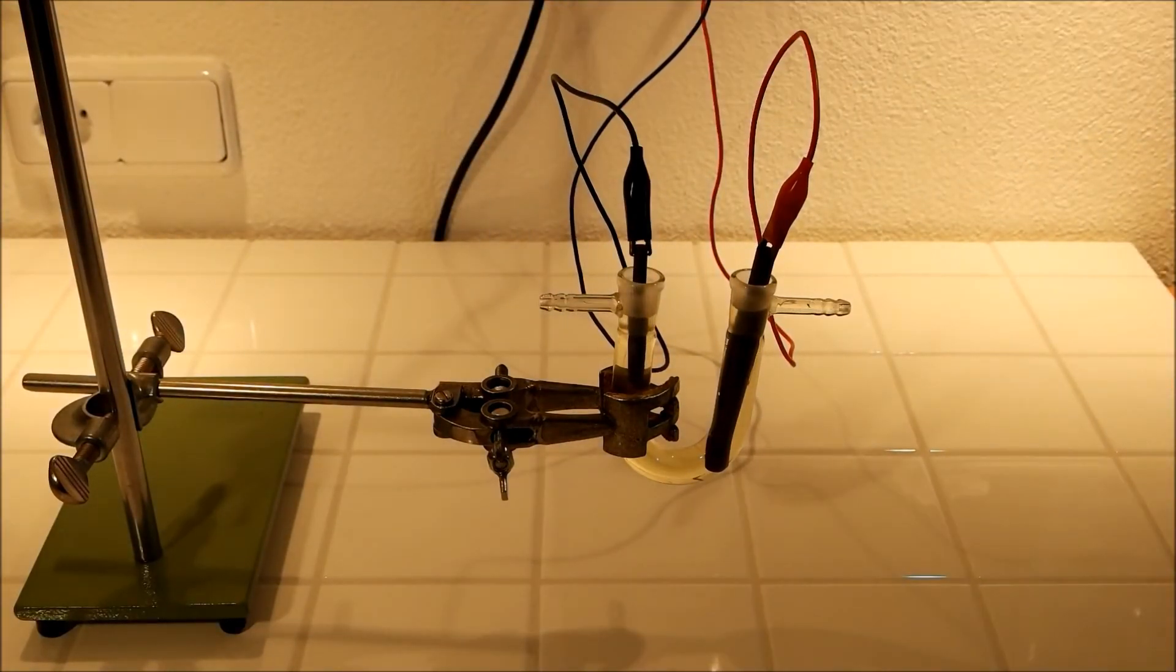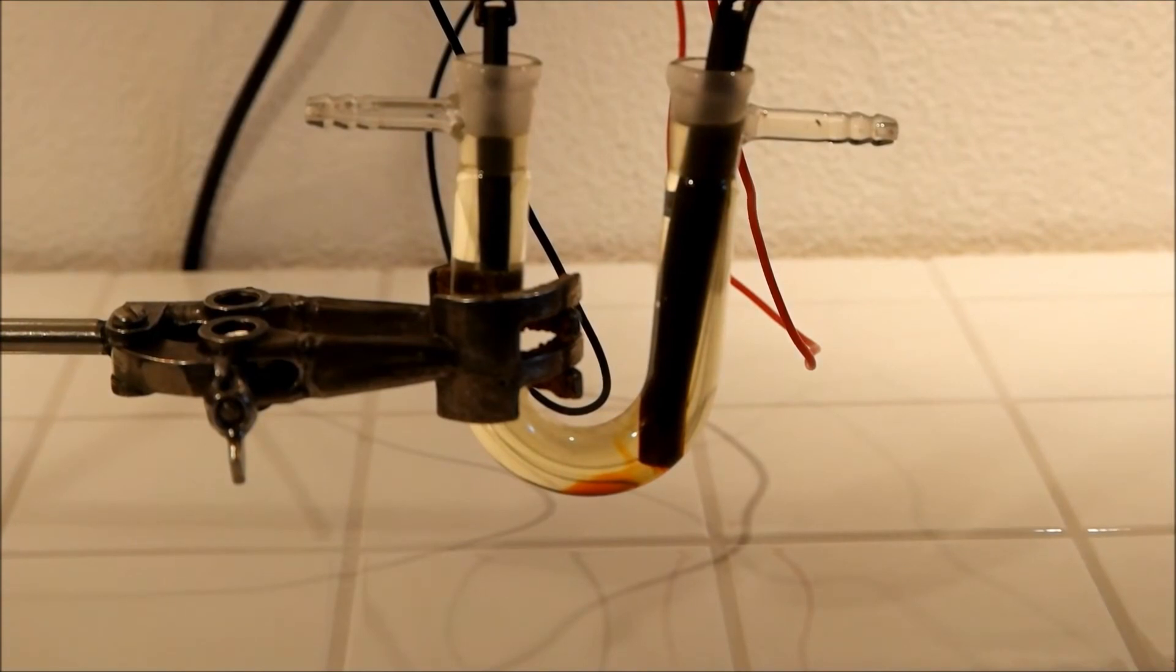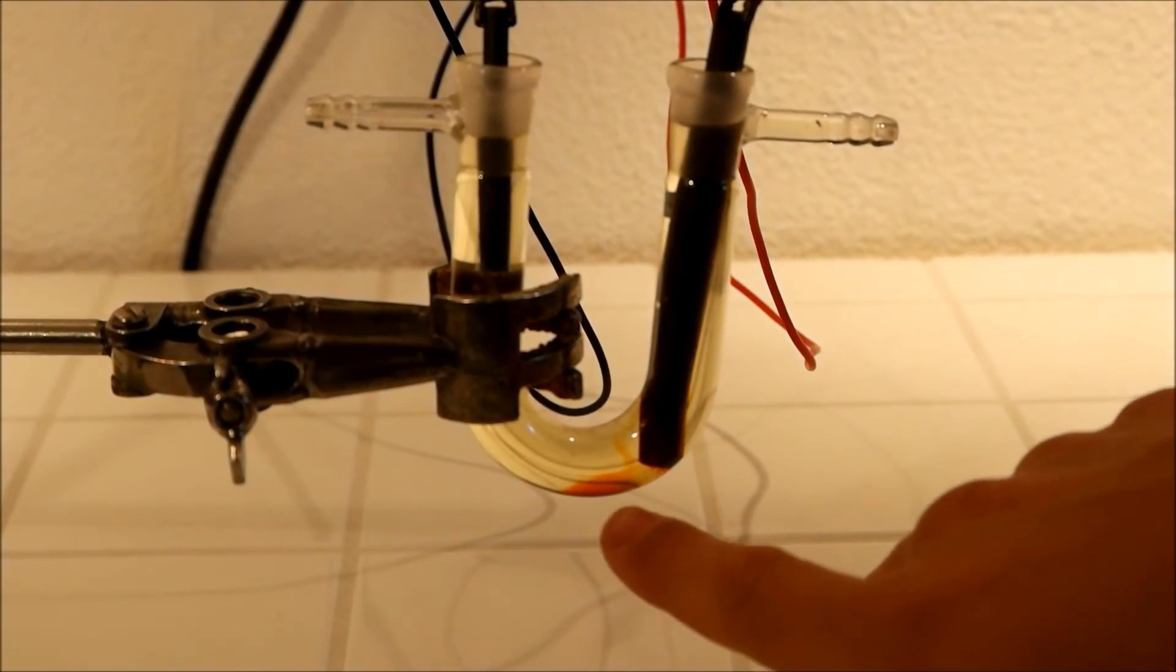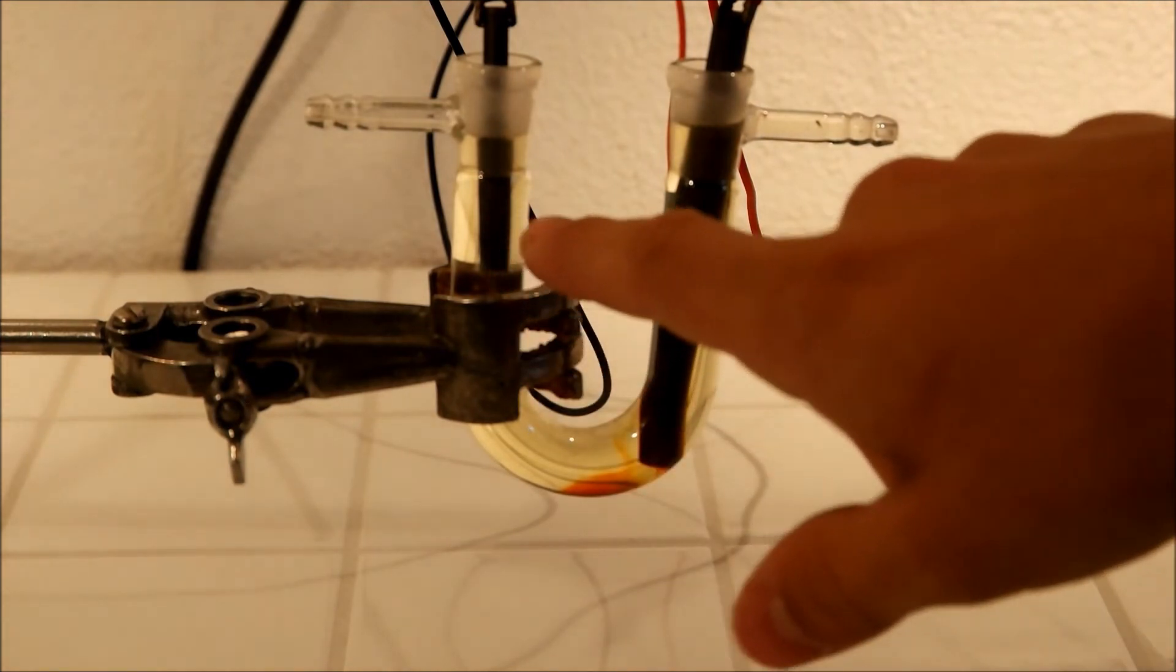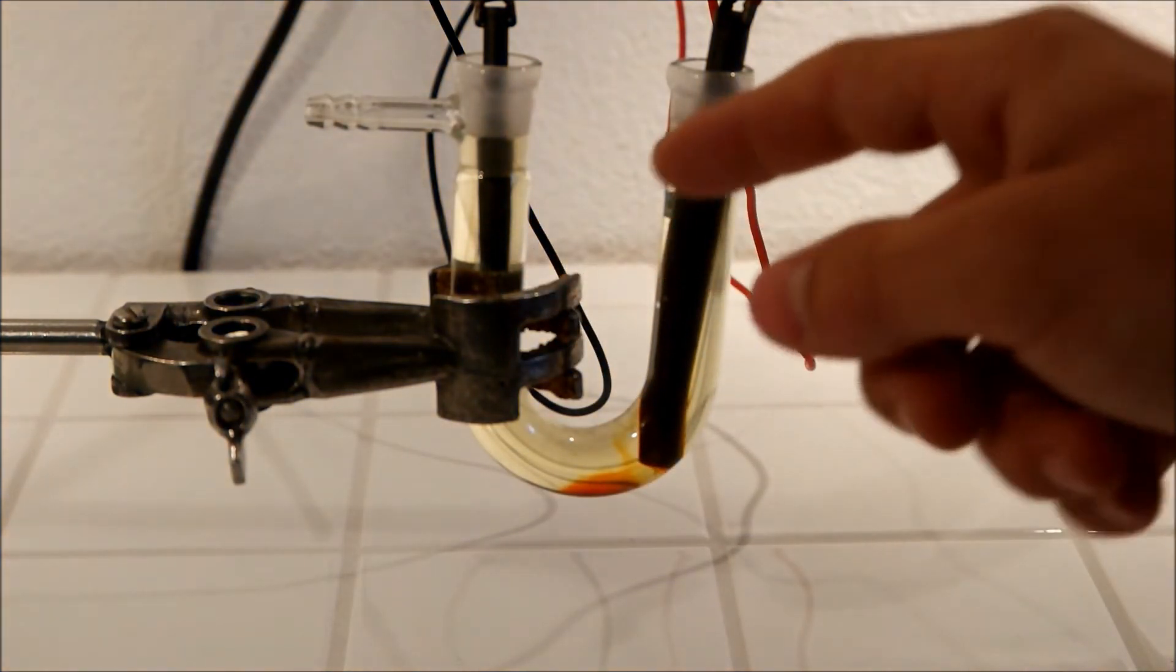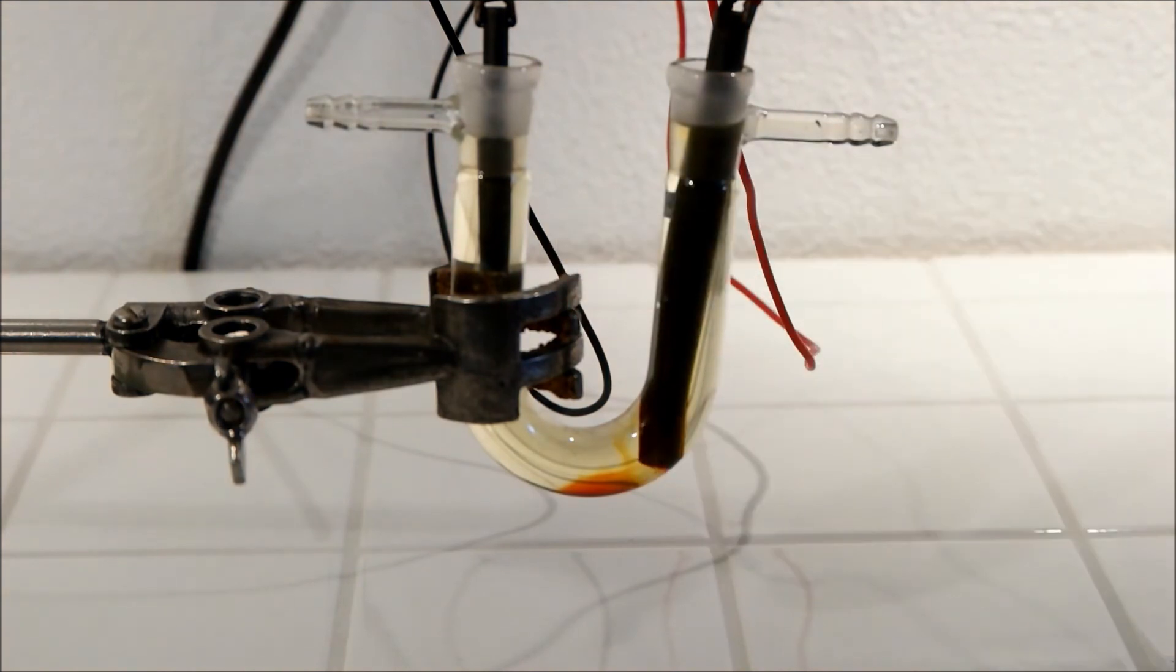Now you have to wait a few minutes and then you will see the reaction. On the positive pole you can see that a bit of iodine is produced and on the negative pole there is zinc depositing on the electrode.